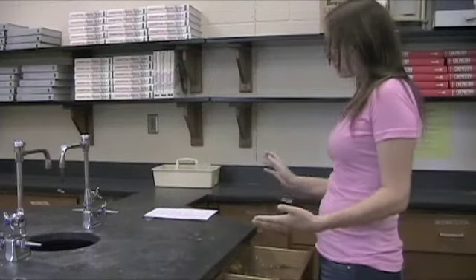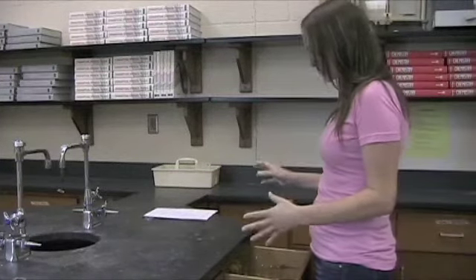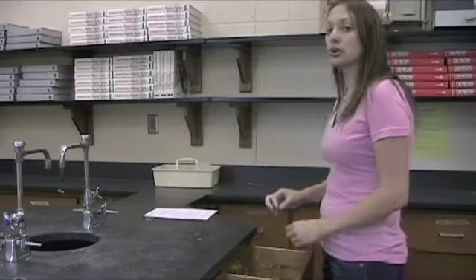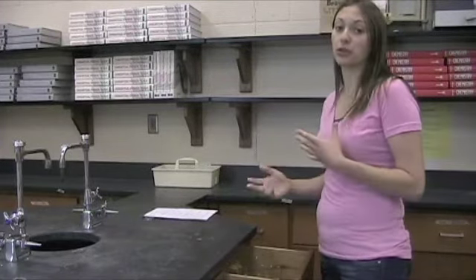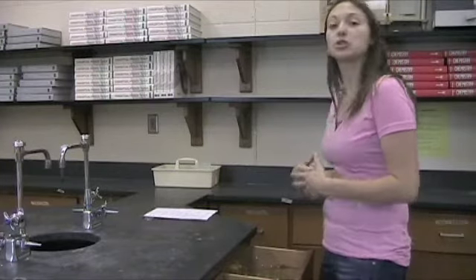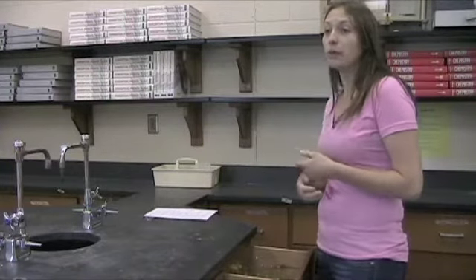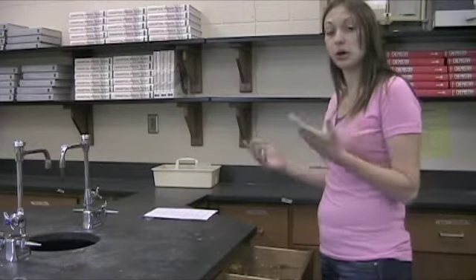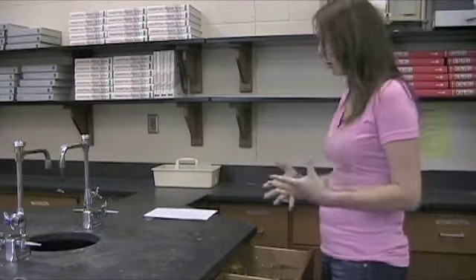Okay, so we're going to learn a little bit about your lab equipment that's going to be in your lab drawer and also in the side cupboard and then we're also going to go through some lab equipment that you're not going to have in your drawer which you will see in the lab setting. We might use it once or twice throughout the year or we might not use it all, it's just good to know what they are.